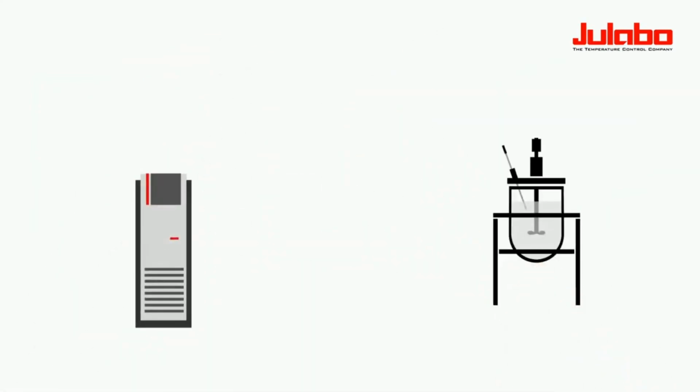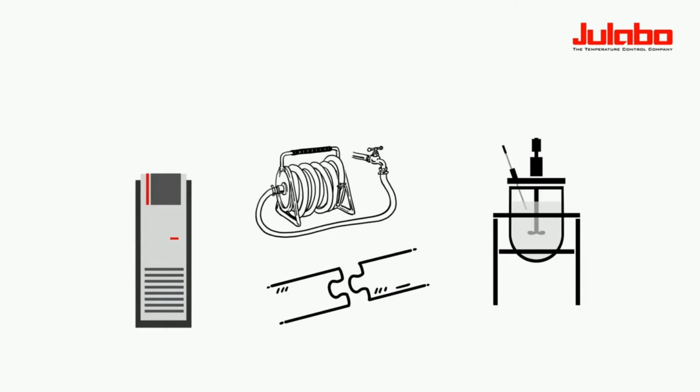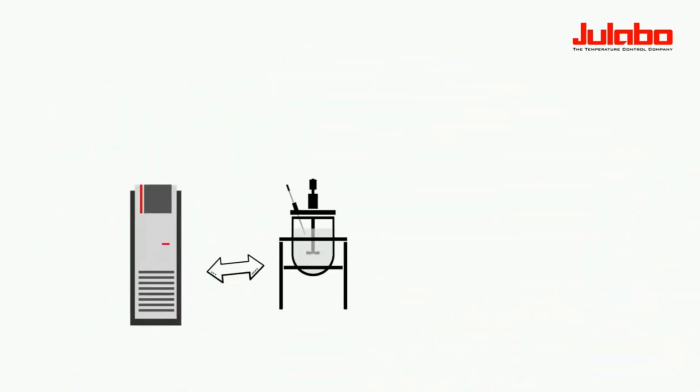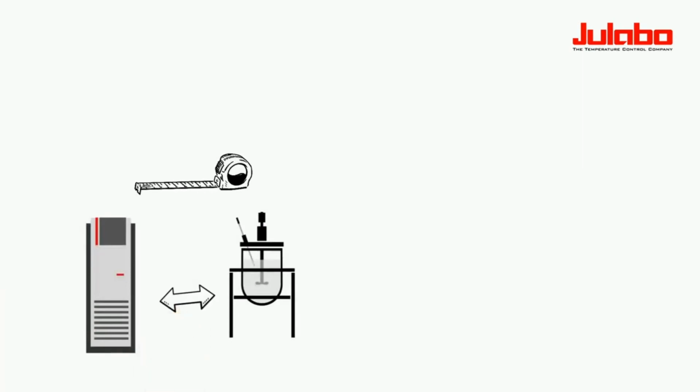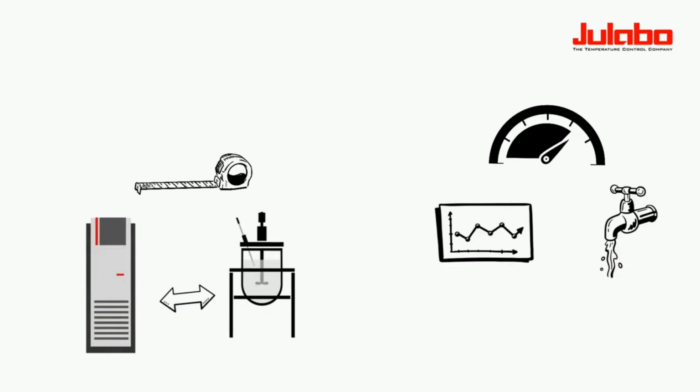With an external application, the temperature control unit is connected with tubing over a distance. In this case, in addition to the temperature range, the type of application is also important. Classical reactors, solids, or special apparatus are all possible examples. The distance to the temperature control unit, the pressure conditions, the desired flow rate, the temperature gradient, as well as the cooling and heating capacity are also important decision criteria.